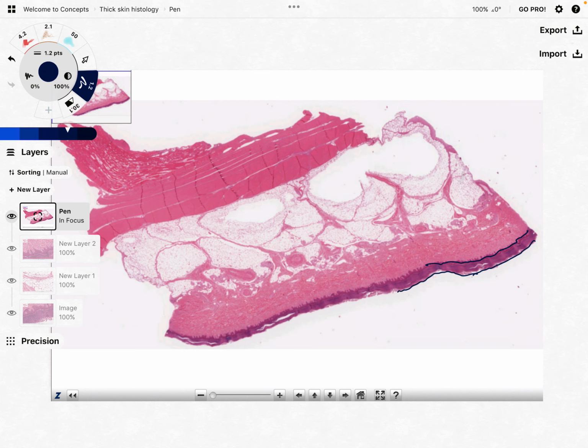It's kind of thin, but it stains really dark purple. And this is the epidermal layer. So I'm going to denote that with an E here. All right, below that is a deep rosy pink color, if you will. And that deep rosy pink color, which also stands out, is going to be the dermis. Put that with a D.